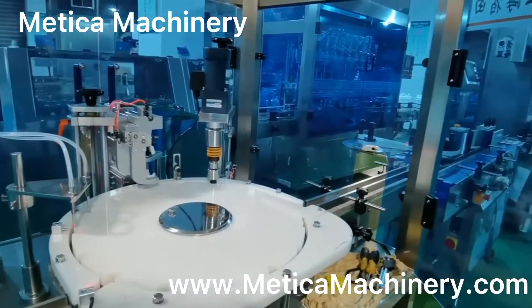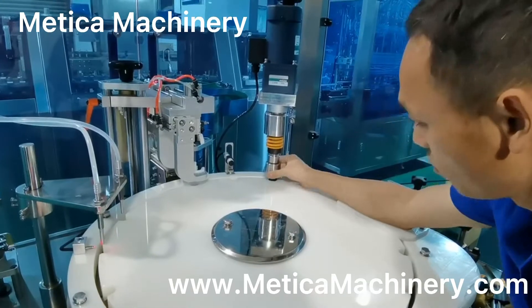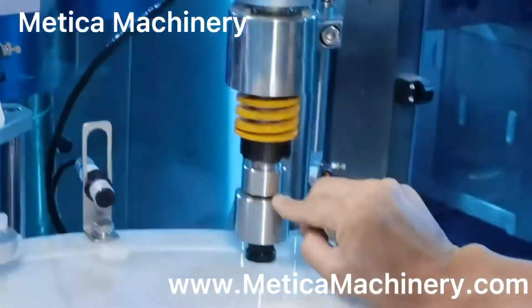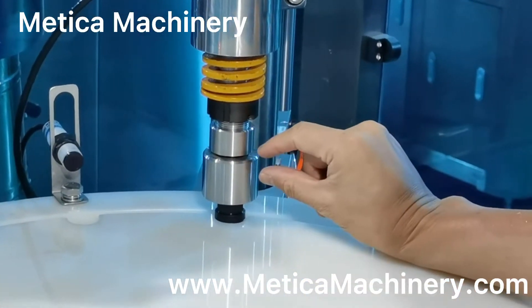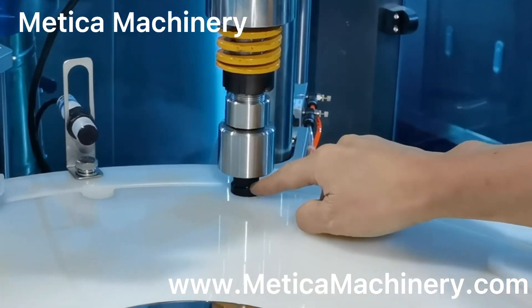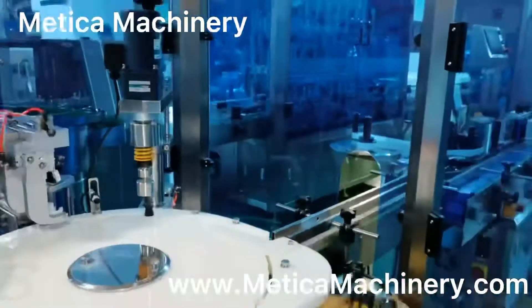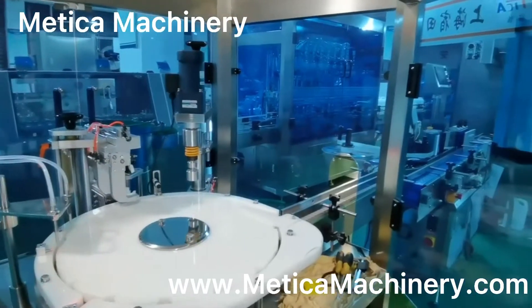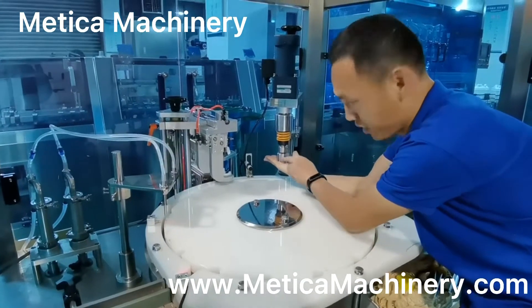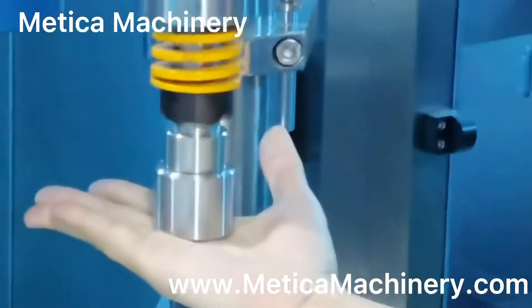We can check from here. This is the press. When the capping head comes to the lowest position, it needs to press this, but not too much. Normally, halfway is okay. If it's too much — like this — it will get the bottle broken from too much pressure. You can see it's pressed like this; halfway is good. Not too much, otherwise there is too much pressure on the bottle and it's easy to break.